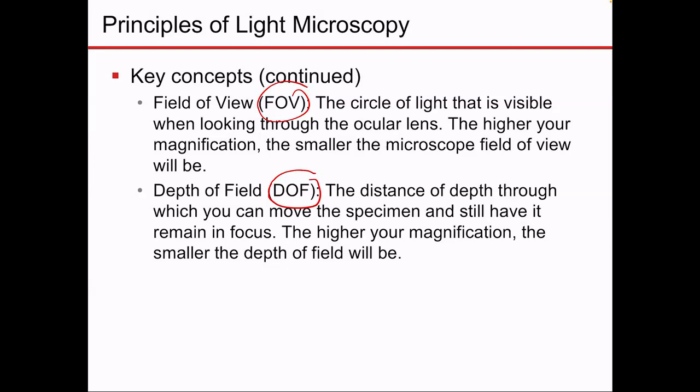The field of view decreases because increasing magnification means you are zooming into the sample to look at a smaller area. The depth of field decreasing means that you won't be able to focus simultaneously on the whole depth of the sample if you keep increasing the magnification.